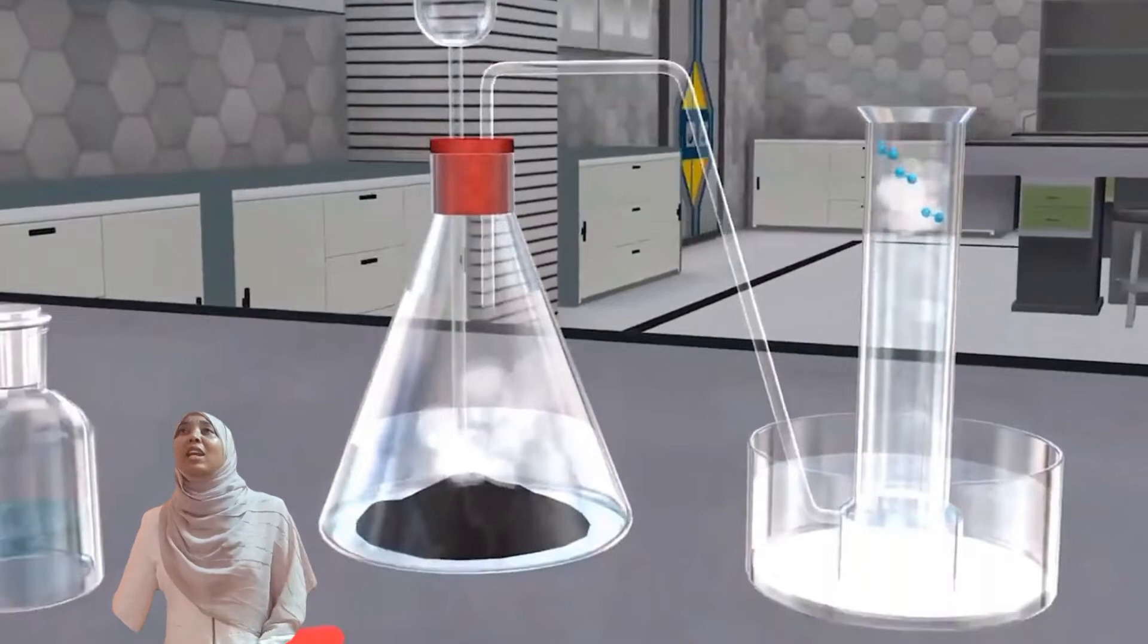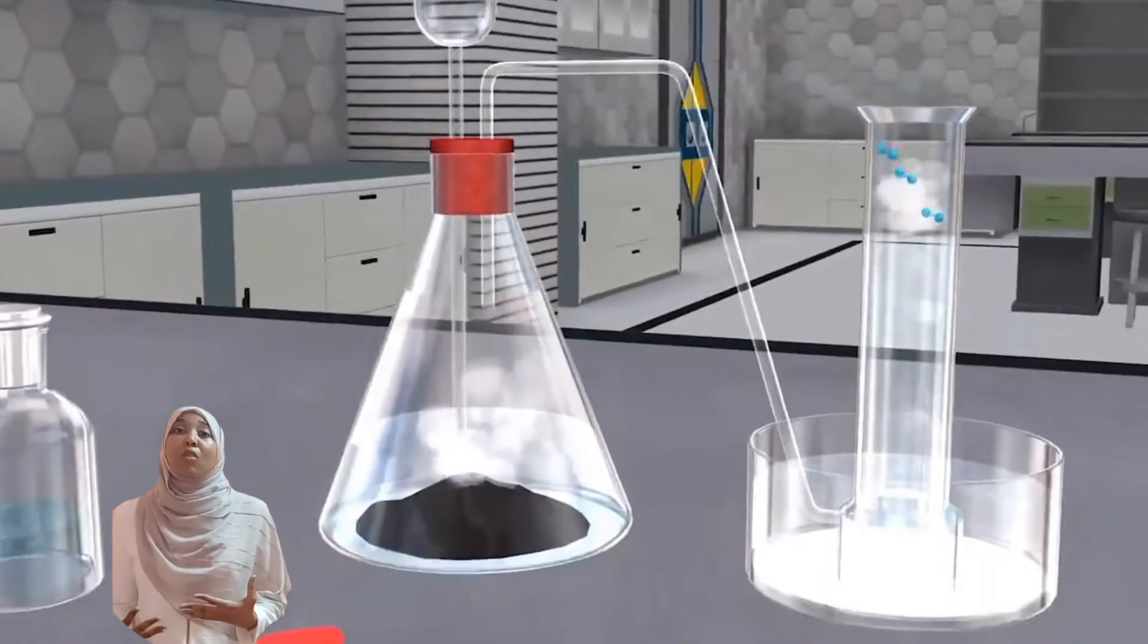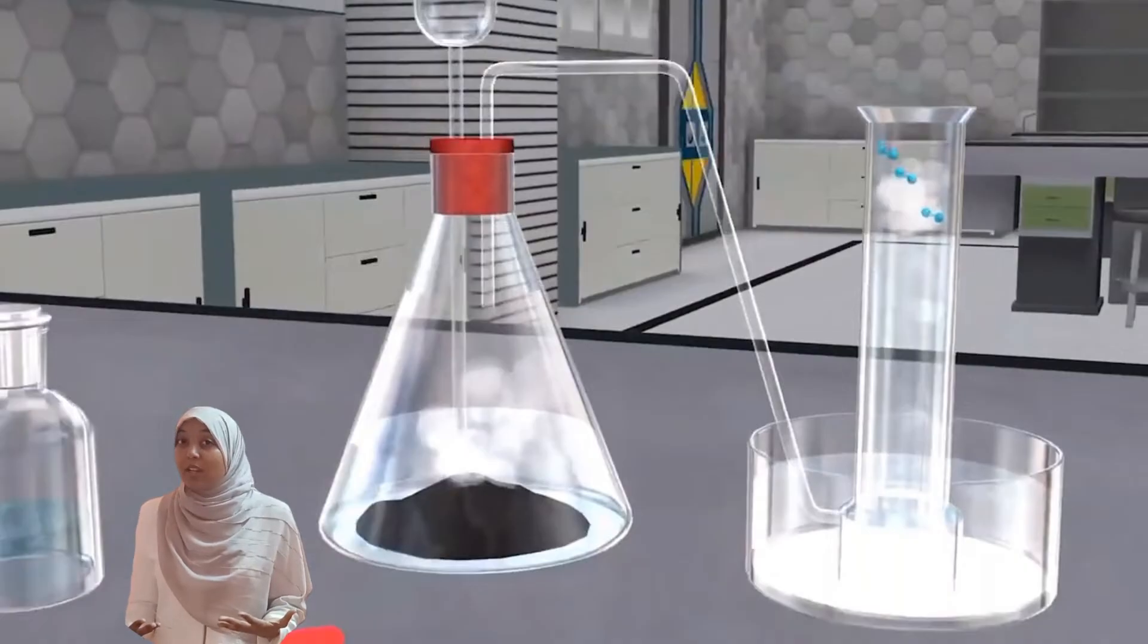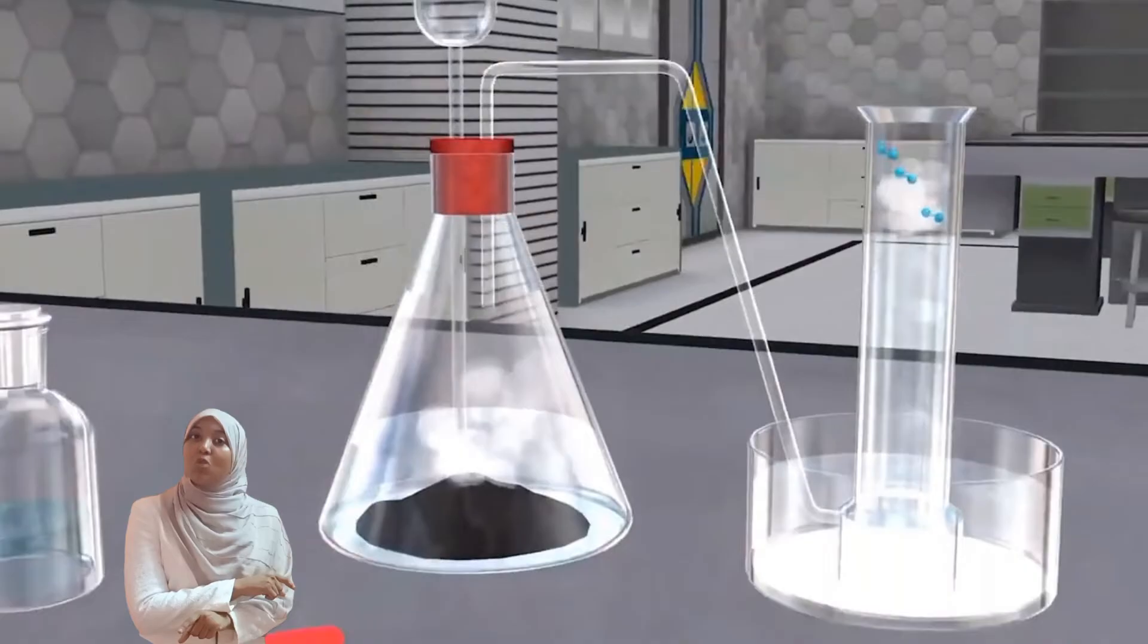This makes sense because if you're having a gas that is soluble in water and you're collecting it over water, the gas will simply dissolve in water. At the end you will have no gas to collect; it will have formed a solution. Oxygen gas can be used for this method because it's slightly soluble in water.